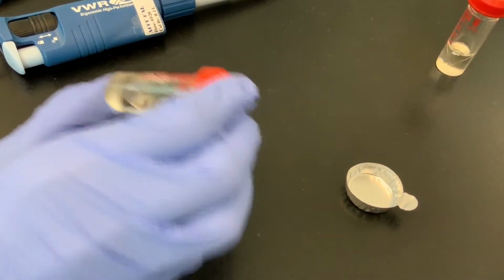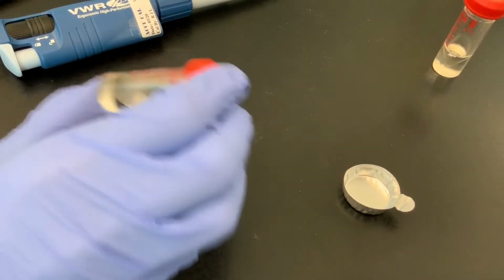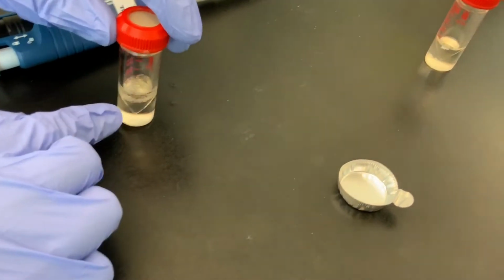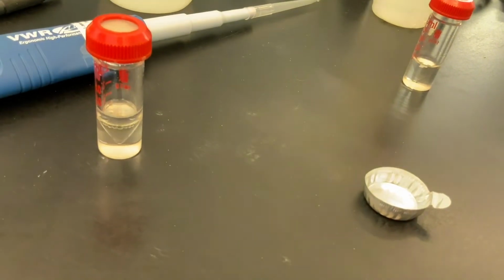And so what we want to eventually figure out is how much benzoic acid still remains in the organic layer. And so you can see now I still have 2 phases. At the interphase, the bubbles are sort of waiting to just pop, so I'm going to let that sit for a second.